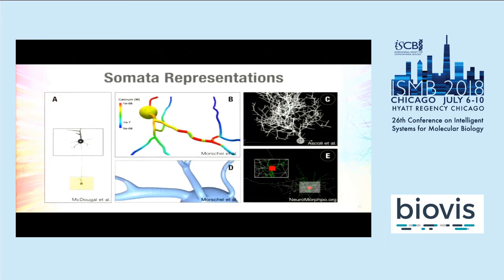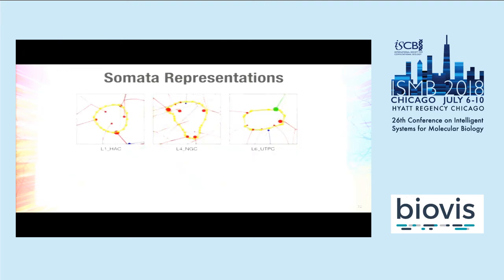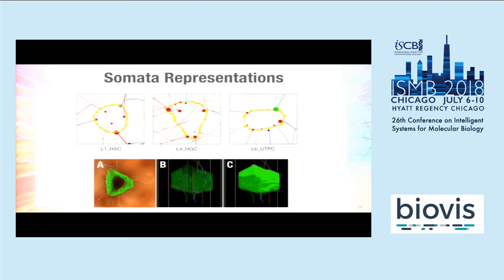Okay, so the next thing is soma reconstruction. Normally, we have the somata represented by spheres or cubes or cylinders, and this is not true, because what we can see in the ASCII files is basically a 2D profile like this. In order to get a 3D profile like this, we need an advanced optical microscope, and the majority of the morphologies haven't been reconstructed by such a microscope.